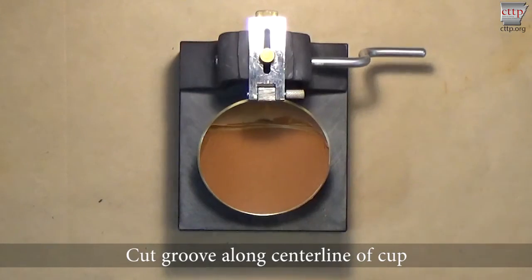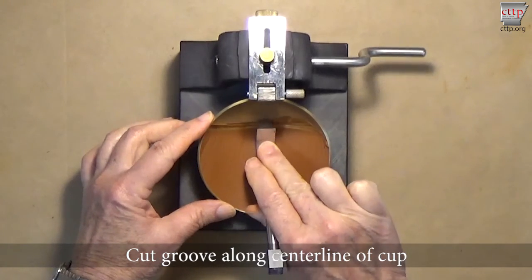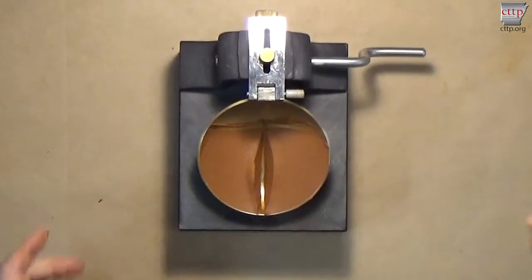Cut a groove along the center line of the cup using a firm stroke of the grooving tool, cleanly dividing the soil. Check the soil depth when cutting the groove. Since the curved grooving tool is 10 millimeters thick, its top surface indicates the target soil level. If the soil is not at the proper depth, remove it from the cup, then clean the cup, grooving tool, and spatula, and try again.